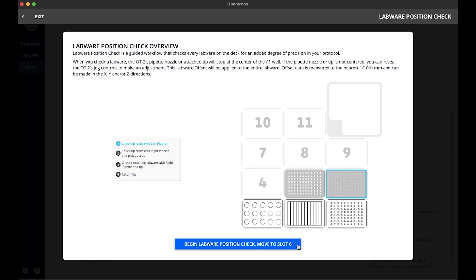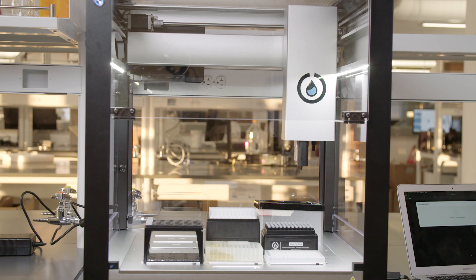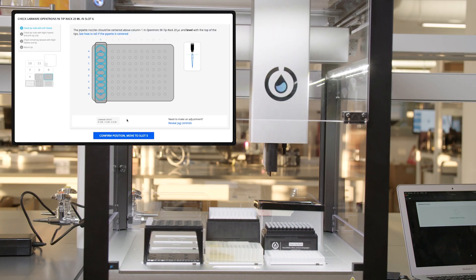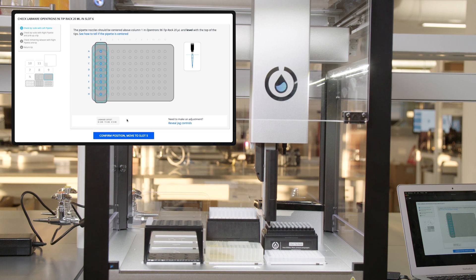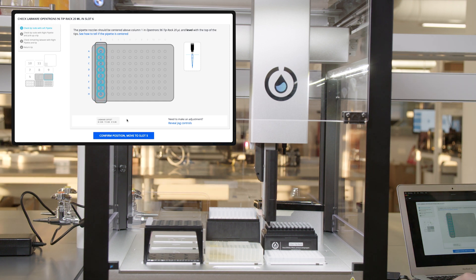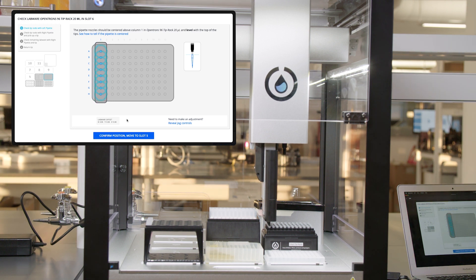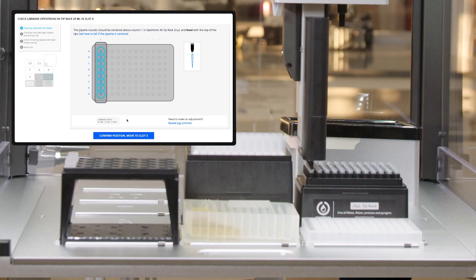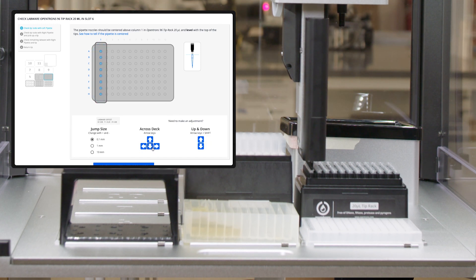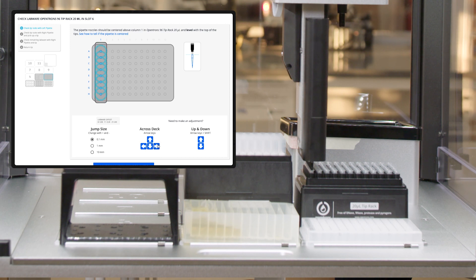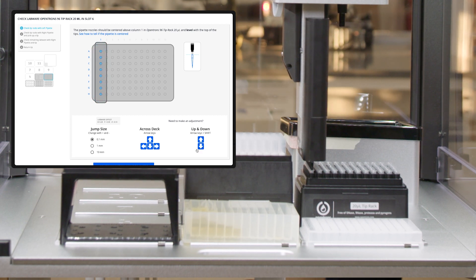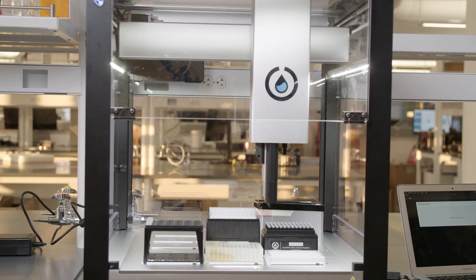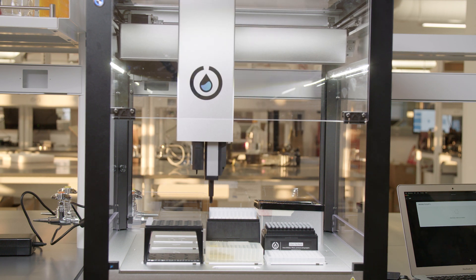Once I click begin labware position check, the OT2 will move the pipette to slot six in tip A1 and I'll need to position all the nozzles to be aligned with column one. Once the OT2 is over the tip rack, I need to confirm that all nozzles are in the correct location and aligned properly. If the channels are not perfectly aligned, I can click on reveal jog controls, which I will do because the pipette is minimally off. The jog controls will be displayed now. I'm going to quickly adjust my pipette so they are aligned. I will now confirm position.